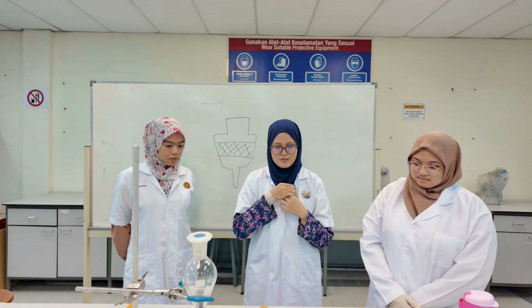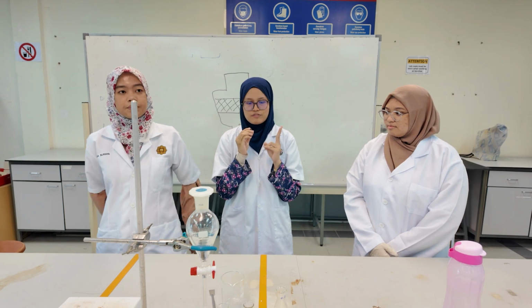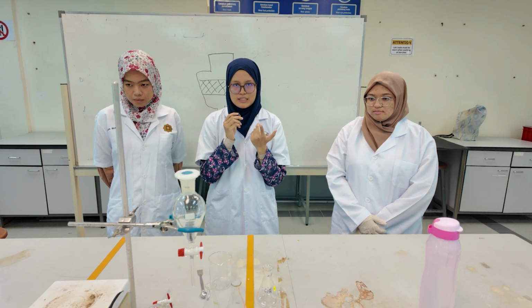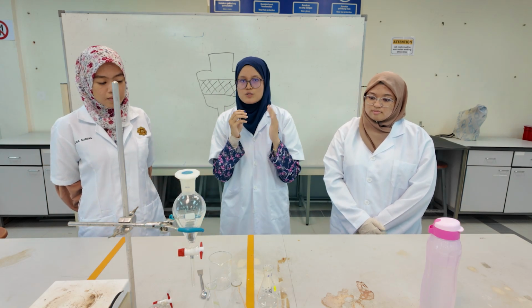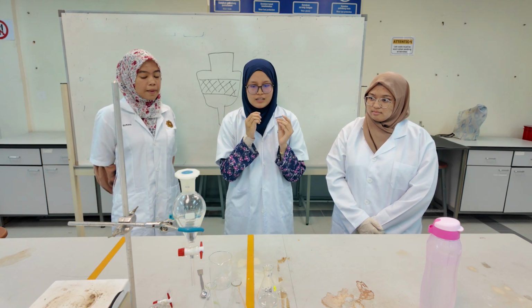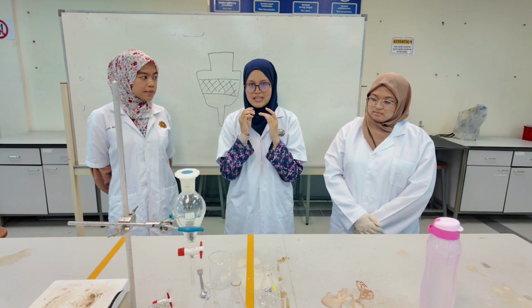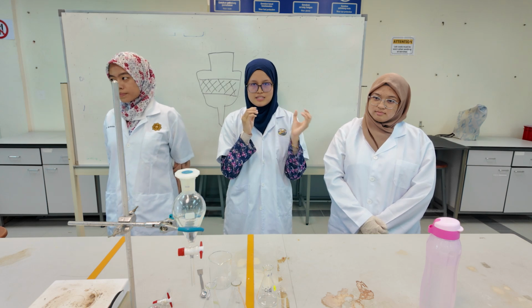Basically, it is a technique that we use to separate compounds based on their solubility in two different liquids. We always use an organic solvent and also water. When we mix these two liquids together, some compounds prefer the water layer and some compounds prefer the organic layer. When we use this technique, we can separate compounds and also purify compounds in a mixture.